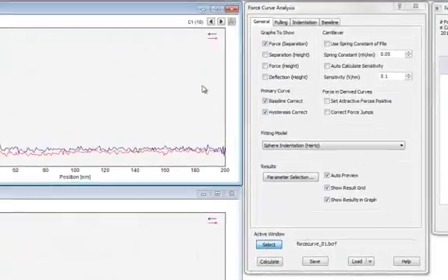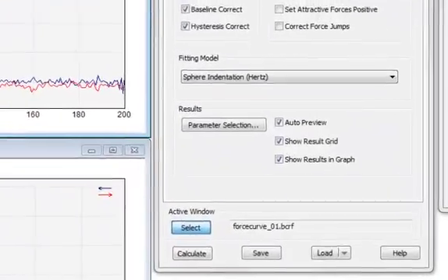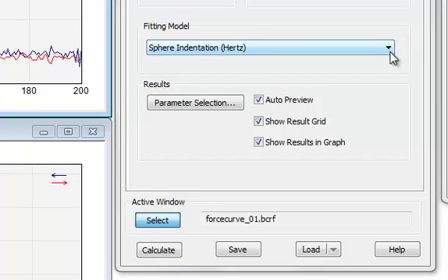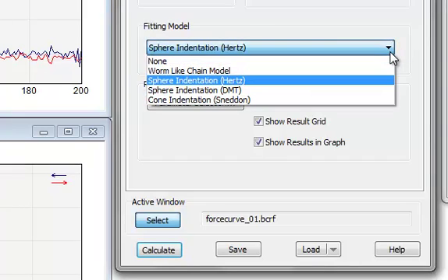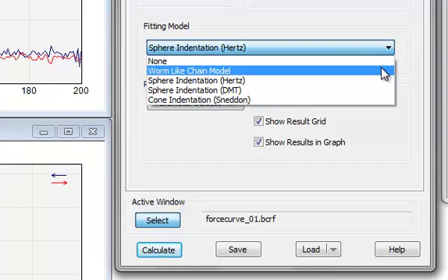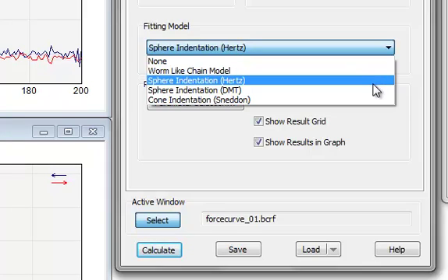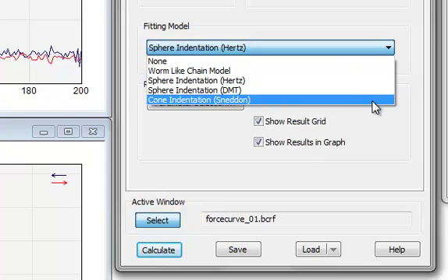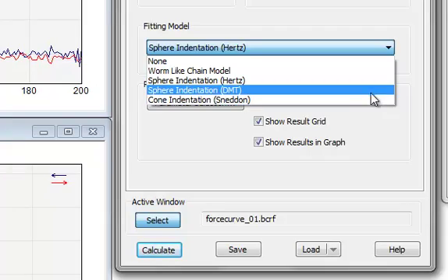You can choose between various fitting models. These include the worm-like chain model for analyzing the unfolding events of a protein and the Hertz and Sneddon models for analyzing indentation experiments.